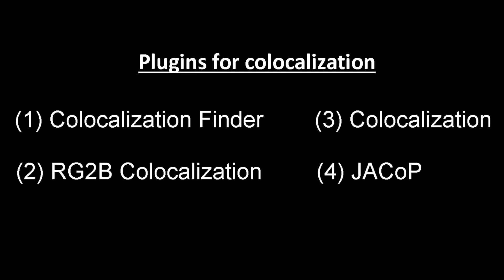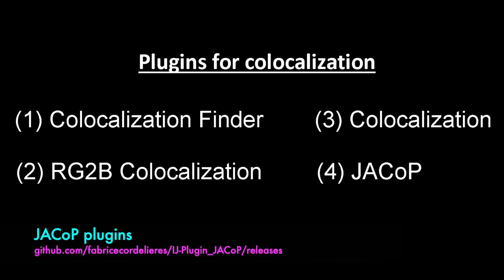Various plugins are available to analyze colocalization. In this tutorial we will use JACoP plugins for the analysis. The plugin is available to download from the website shown on screen. Now let us perform the colocalization analysis.